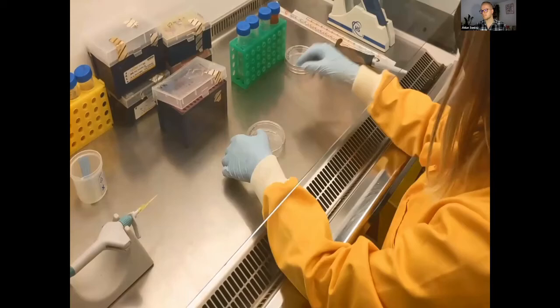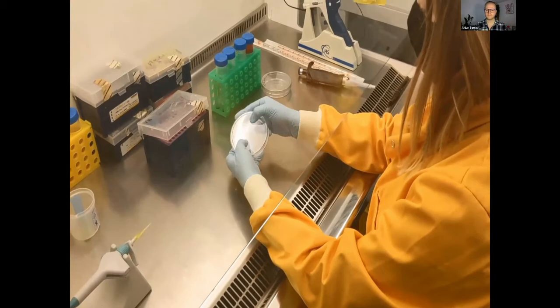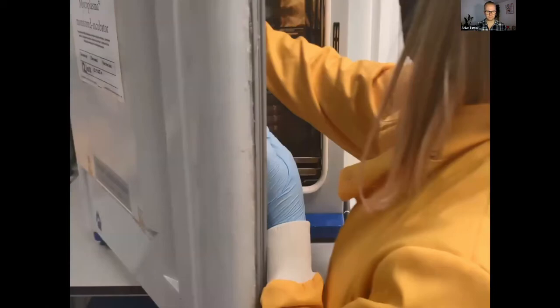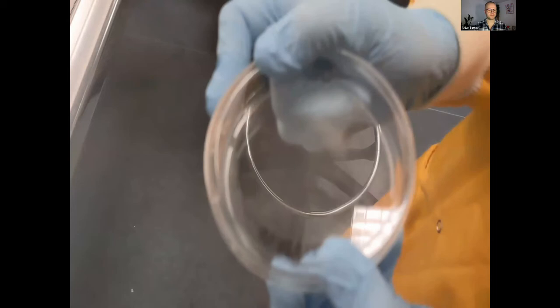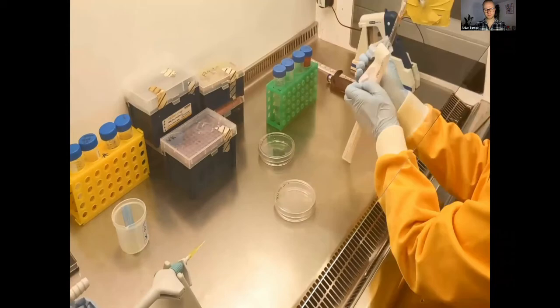The cells are then treated with trypsin, an enzyme that digests proteins, including those proteins that hold the cells to the surface of the plate. This reaction takes a few minutes, so the cells are placed back in a CO2 incubator whilst the trypsin does its job. After a few minutes in incubator, the researcher visually inspects the plate to see if the cells have detached. Now that the cells have detached from the plate, they are returned to the hood for the next few steps.